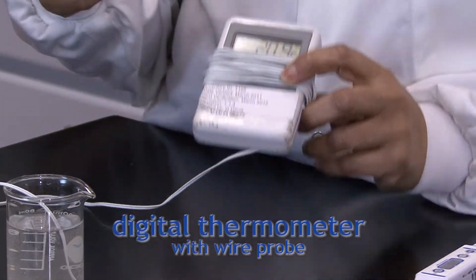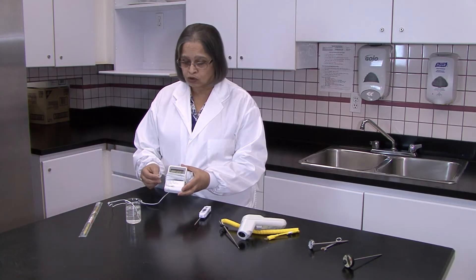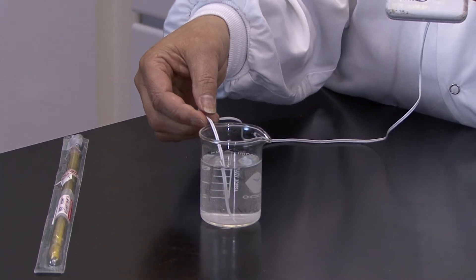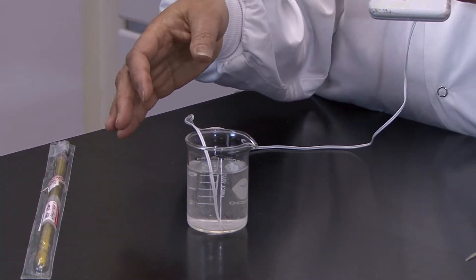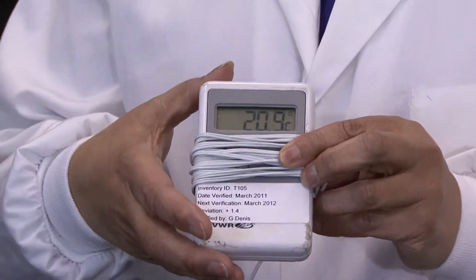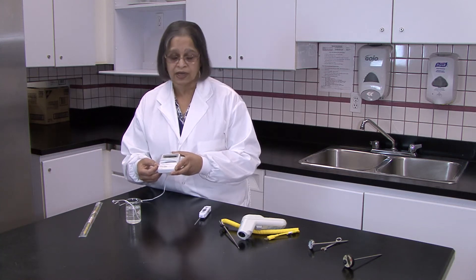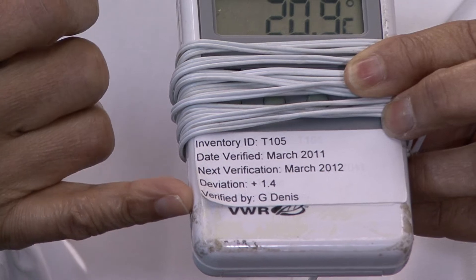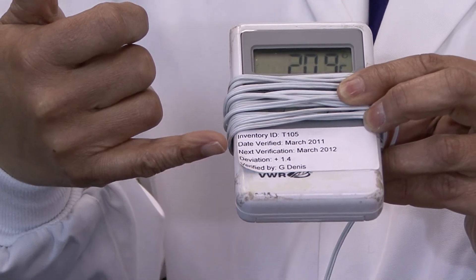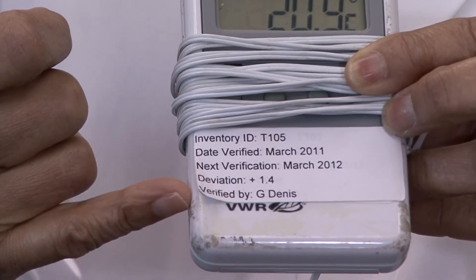Then we have a thermometer that is really great for measuring stationary things, such as the inside of a fridge or a cooler. You simply place the end of the wire into a liquid of glycol or other solution, because that makes it more accurate than just having it loose in the air. It has a digital readout which is nice and large. An important feature is that the label indicates the date it was calibrated, a unique inventory number, the date that calibration is due again, the deviation of 1.4 degrees — meaning it reads 1.4 degrees higher than expected — and who verified it.